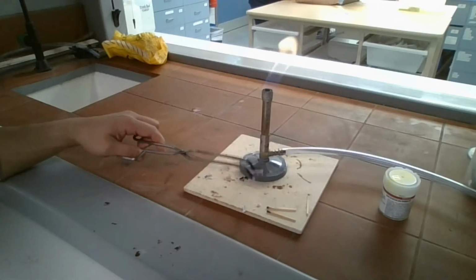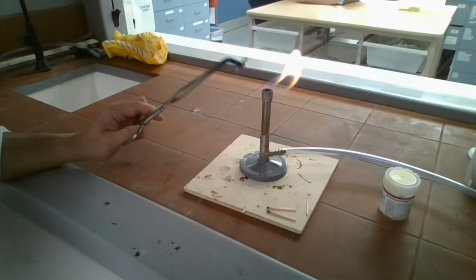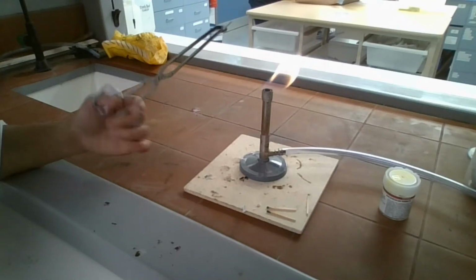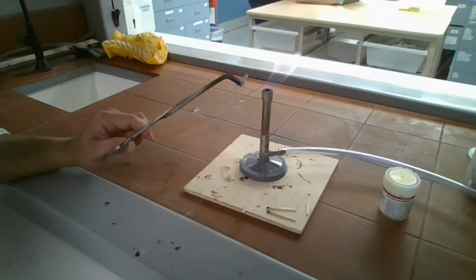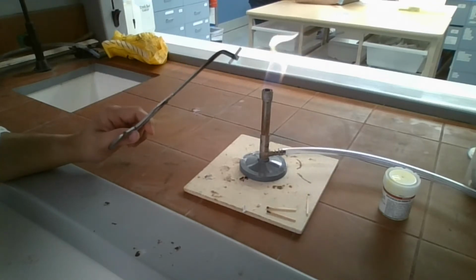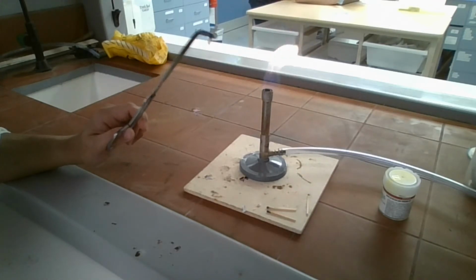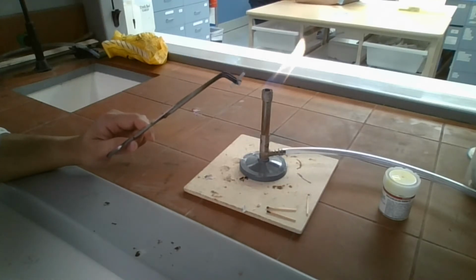Right. Now, from that reaction that you just saw, you need to figure out what were the reactants. Well, you know what was used here, magnesium. Magnesium was definitely part of the reaction, because it caught on fire and it was burning. So burning in chemistry, hope you're thinking about oxygen, because when you burn something, you are oxidizing something, in a lot of cases, especially with things burning. So oxygen is another reactant.